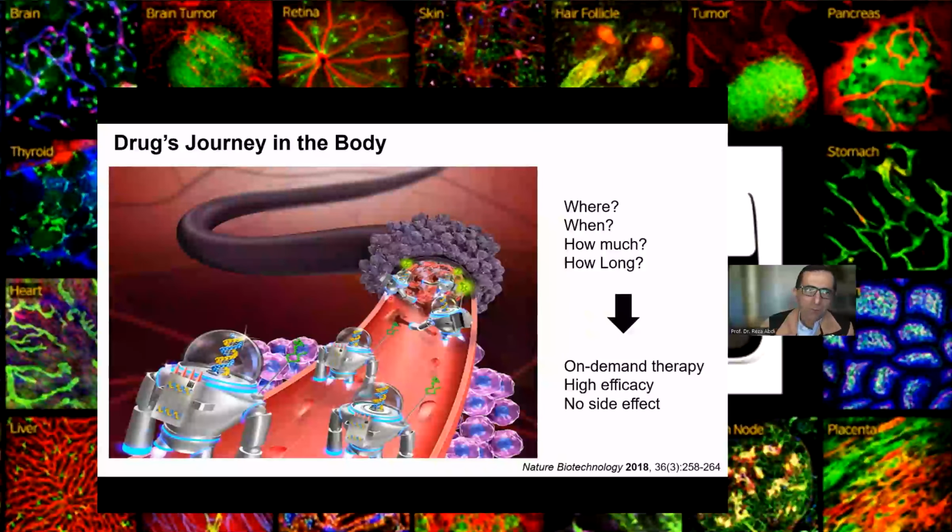So one of the main lines of research we are pursuing in our lab is to deliver nanoparticles. And one of the biggest problems with nanoparticle delivery is actually looking at the homing of it, which I was very interested to collaborate with Pilhan on.